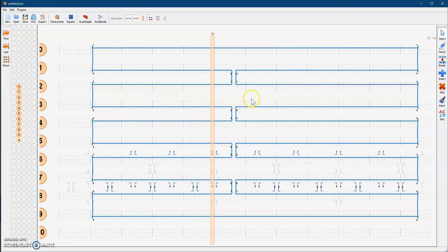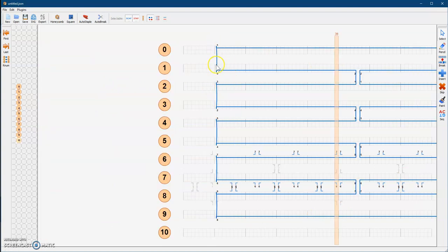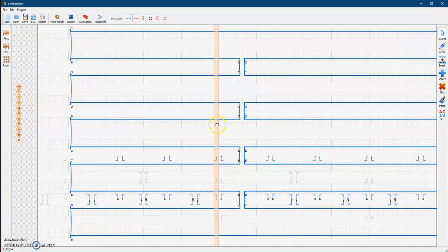One thing to keep in mind: even though everything has big gaps in between, in the real world when the actual DNA forms, these gaps are very tight. There are hairpin turns here — not these big giant crossovers, but hairpins. The DNA crunches up so everything looks solid. It might not look solid here, but if you look at DNA origami structures, they look pretty solid. You can see the path the DNA takes if you look closely at images of actual DNA origami formed in the lab. This is just for display purposes. So don't worry when you see these huge spaces — they don't exist. Your shape will look like a square. It's like zooming out very far.